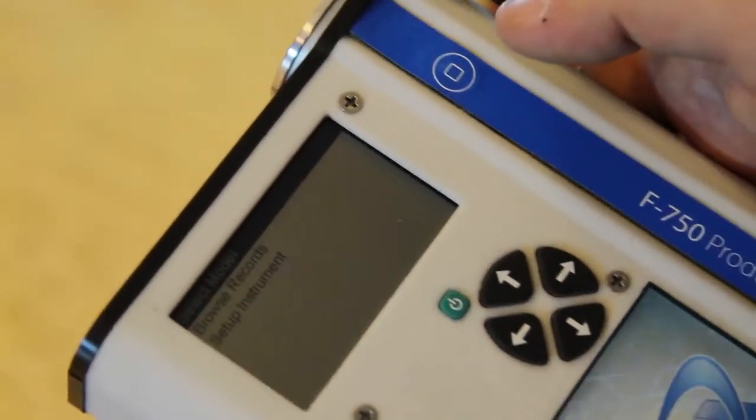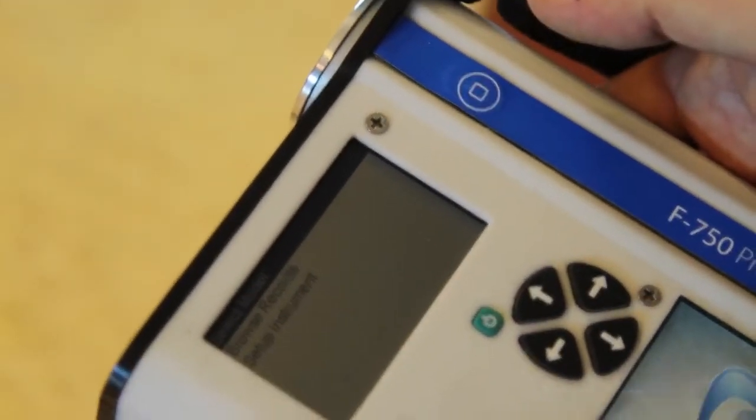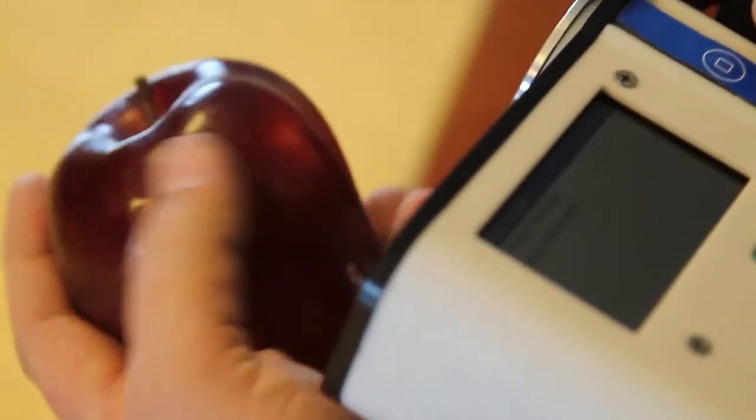We've now loaded the apple model into the F750, and as you can see, we have some apples handy.